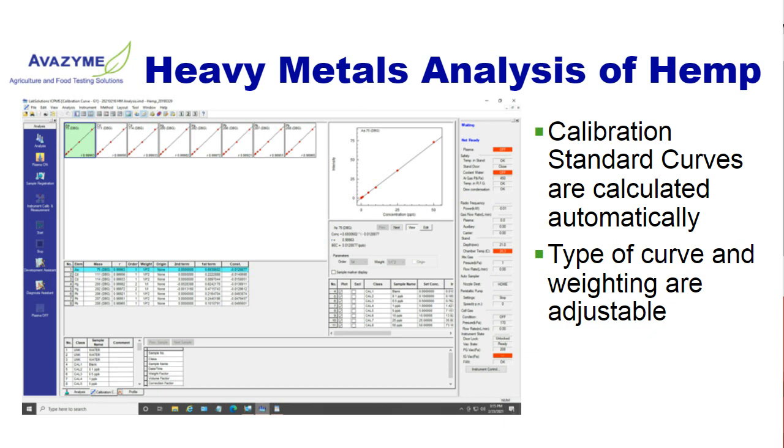In this case, we've got arsenic selected, so it's showing larger on the right-hand side, and you can see all the individual replicate data down below that. And then on each of the others, you can see summaries in the rest of the window.